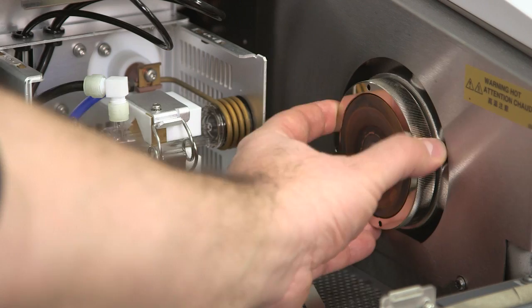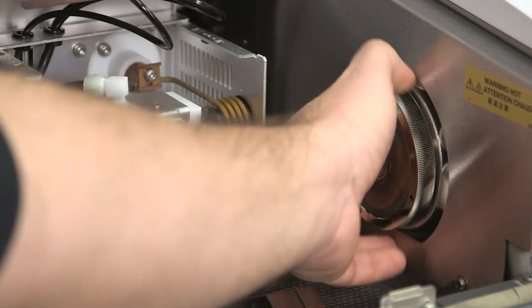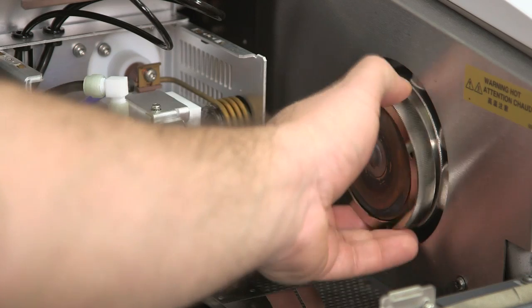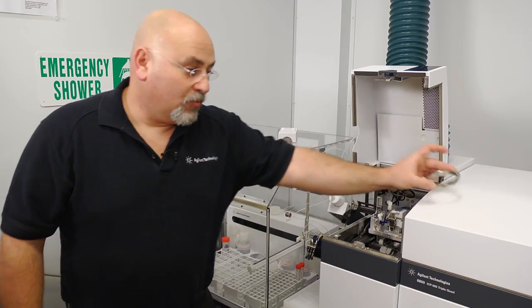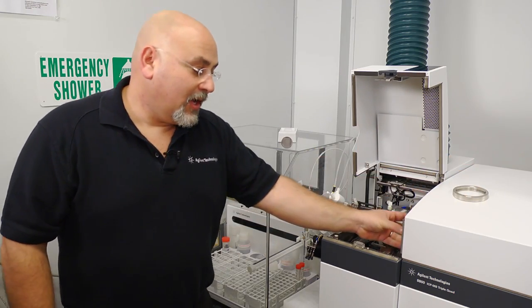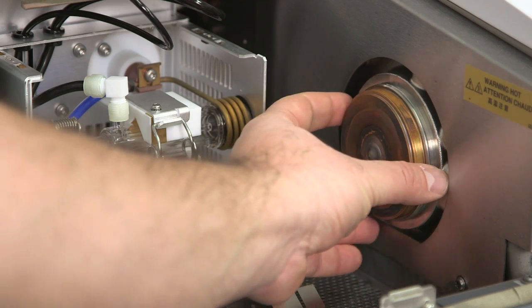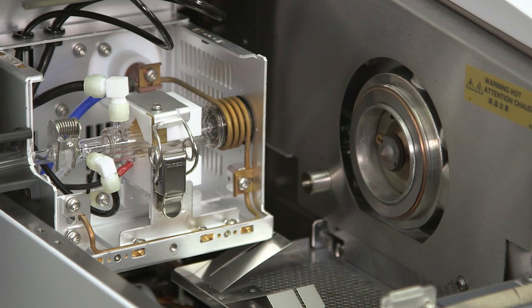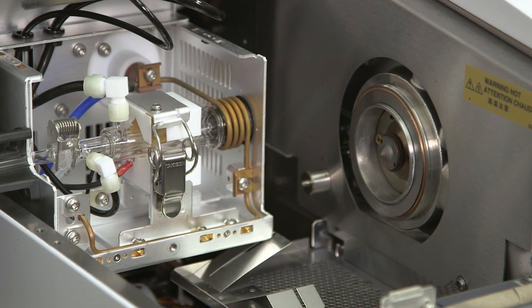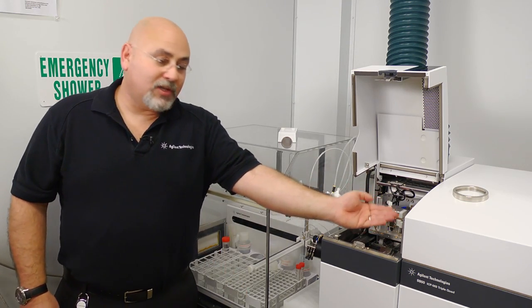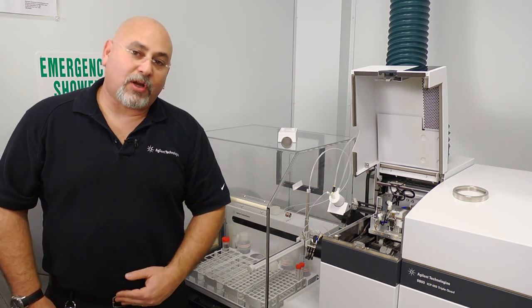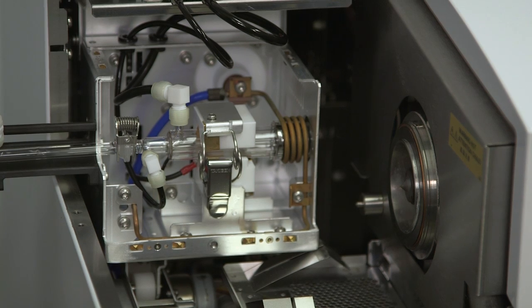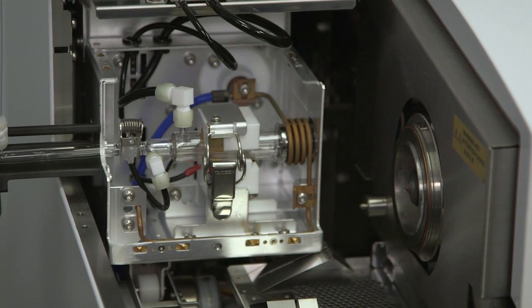The sampling cone is being held simply by a retainer ring, which is hand mounted. And then the cone literally comes out in one piece. And what you can see back here is basically the skimmer cone, which is mounted onto the lens base.